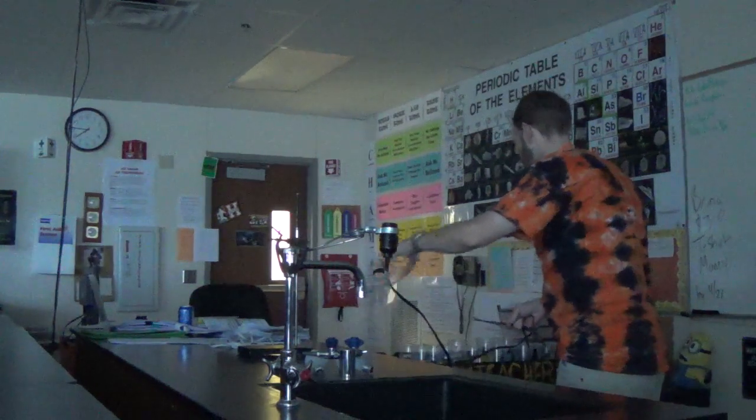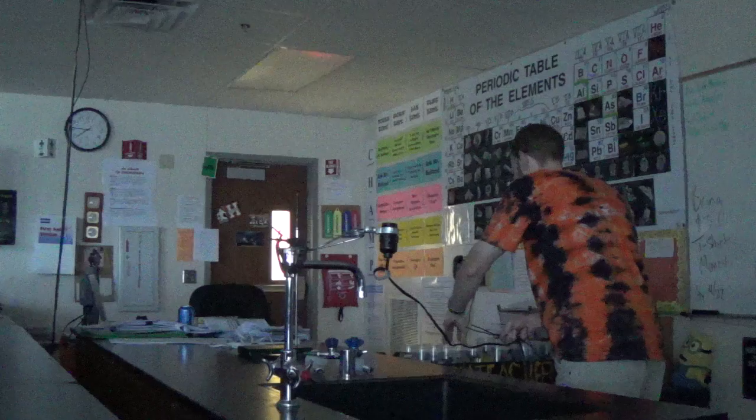Okay, what's next? Sodium hydroxide and distilled water.